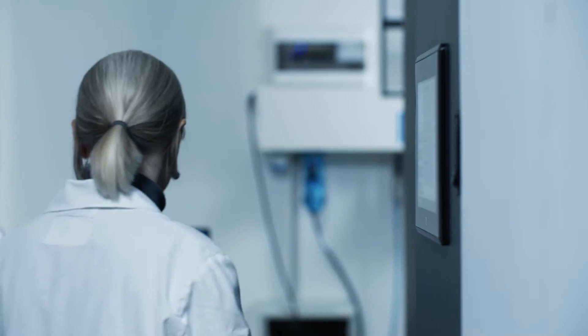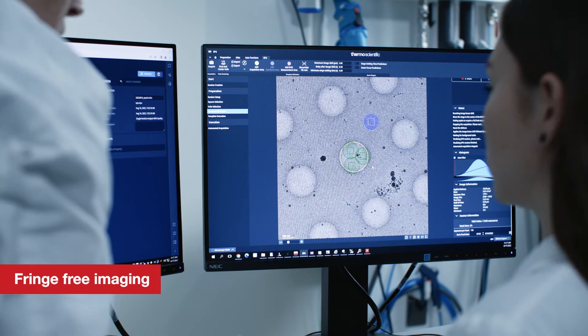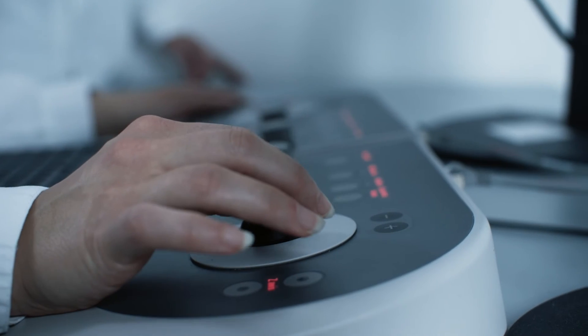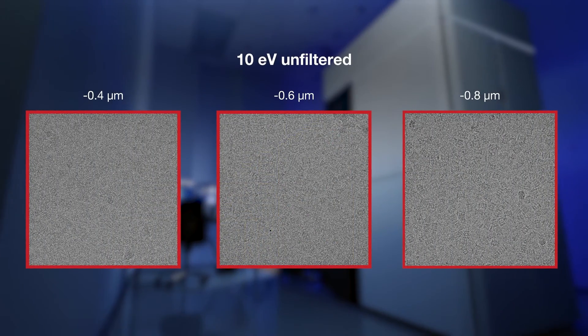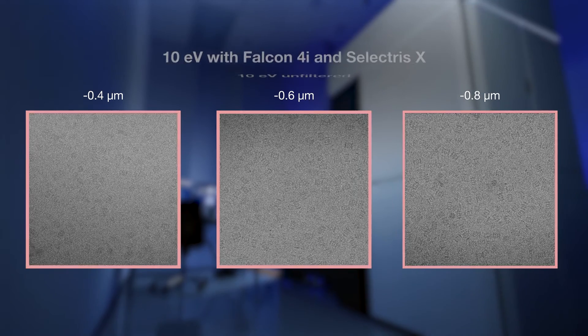We have made advancements to our beam alignment systems by refining the relationship between the stage and lenses, enabling more usable images, and our latest generation of detectors improve image contrast while speeding up data processing.